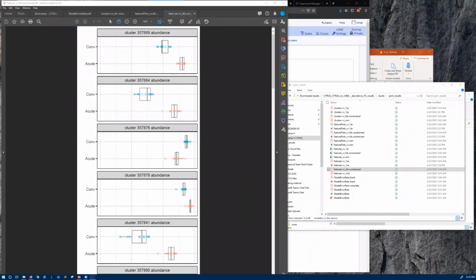Thank you, Junjun. Okay, a question from Vivek. Can I choose which FDR method Citrus uses? Chihao, would you mind answering this? Yeah, sure. I know there are many different FDR correction methods available. Unfortunately, in Cytobank, you cannot choose which one you prefer. I believe in Cytobank, we are using the Benjamini-Hochberg method, which is the most stringent method. That's what we have in Cytobank. Perfect. Thank you very much.